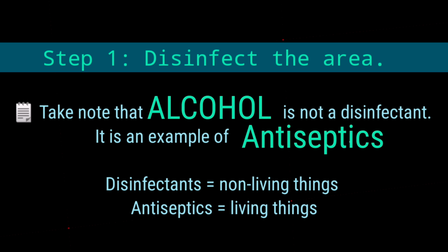Step 1 is to disinfect the area. Take note that alcohol is not a disinfectant. It is an example of an antiseptic. So what is the difference between disinfectants and antiseptics? Disinfectants are those that we use for non-living things such as our countertops, while antiseptics are those that we use for living things such as our human body.